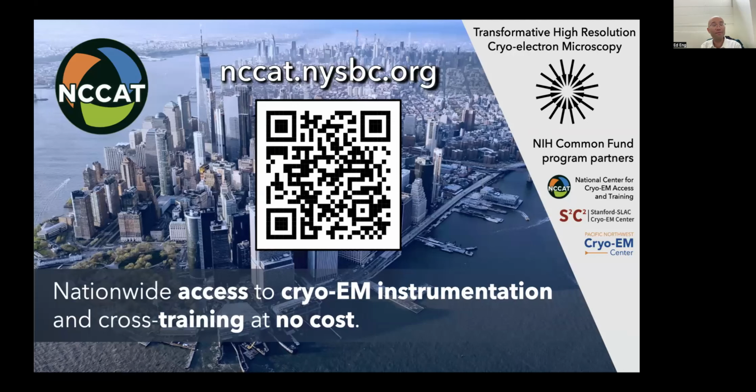Hi, I'm Ed, coming here from New York City, where NCCAT is located. We have been doing a lot of capacity building like the other centers. Pretty soon we'll have 5 Krios instruments, 2 Glacios instruments, a Tundra dedicated for instrumentation access. We offer high-end data collection, screening, and cross-training.